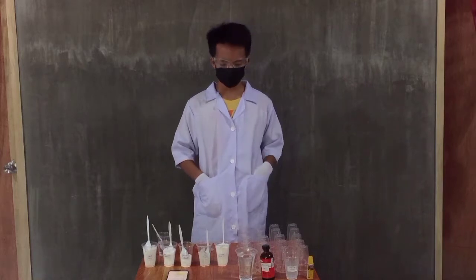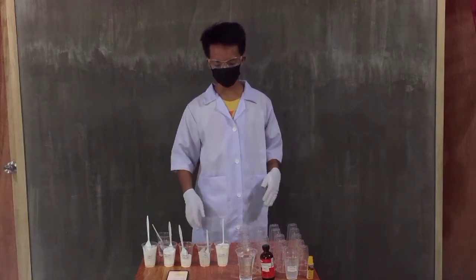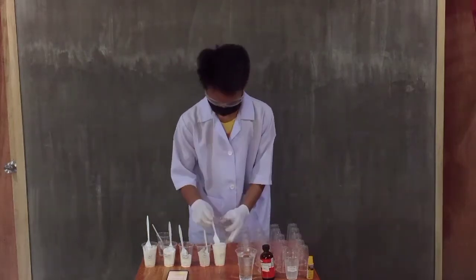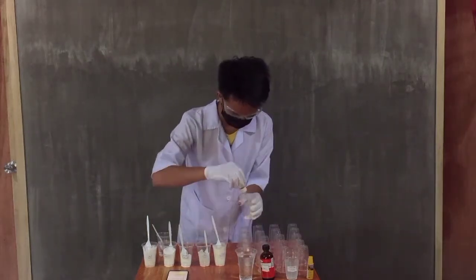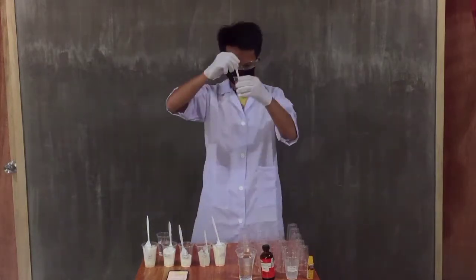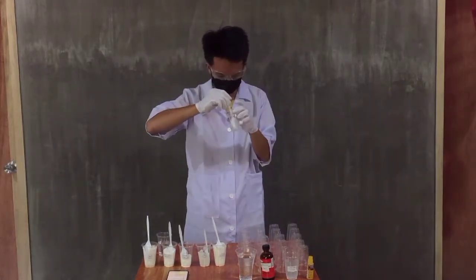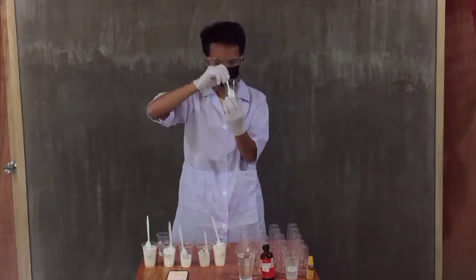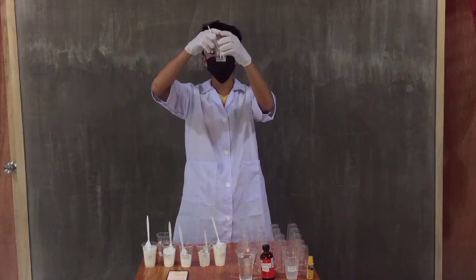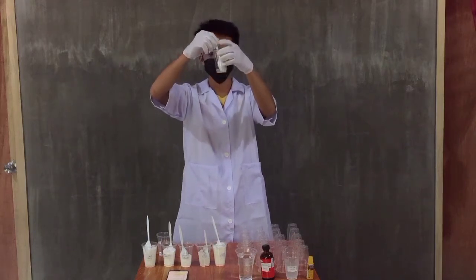At this moment, we will have a mixture of water and sugar. Okay, the sugar dissolved in the water.